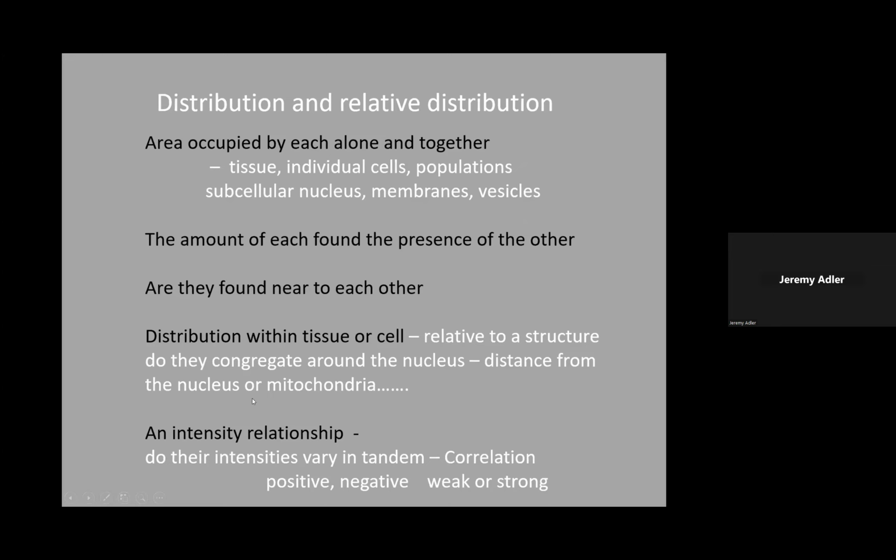We might ask more complicated questions. If they're not in the same place, are they actually near to each other? Again, these are all different questions. So when you're starting out, when you're capturing your pictures, you want to decide what measurements you want to make, and therefore to get images that contain sufficient resolution to support the measurements.